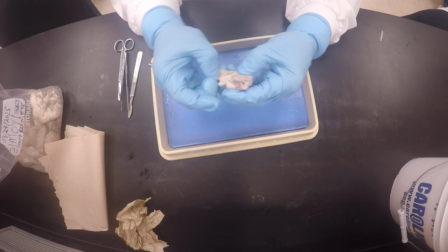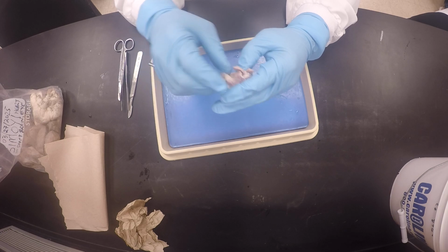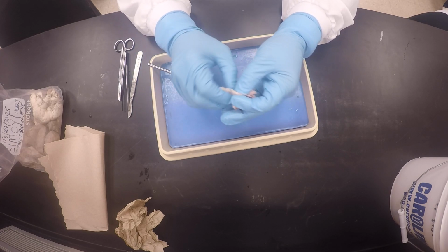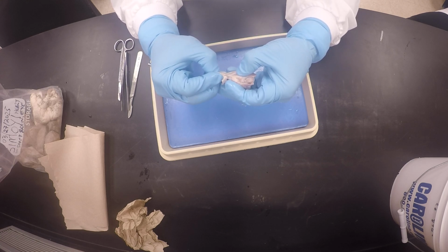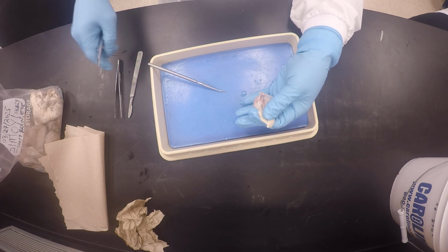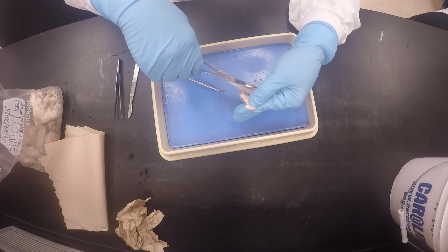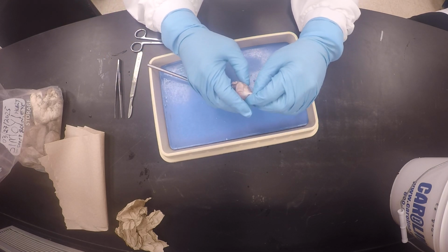So that's why I don't use a cutting instrument. I try to use my fingers, because my fingers don't cut, you see, but instruments cut. And then I don't want to inadvertently. But if I find something that's hard, like this little connective tissue, then I get my little scissors, and then that's when I get to cutting. But not before. You see what I'm saying? So some of these will be blood vessels, little stuff in there.